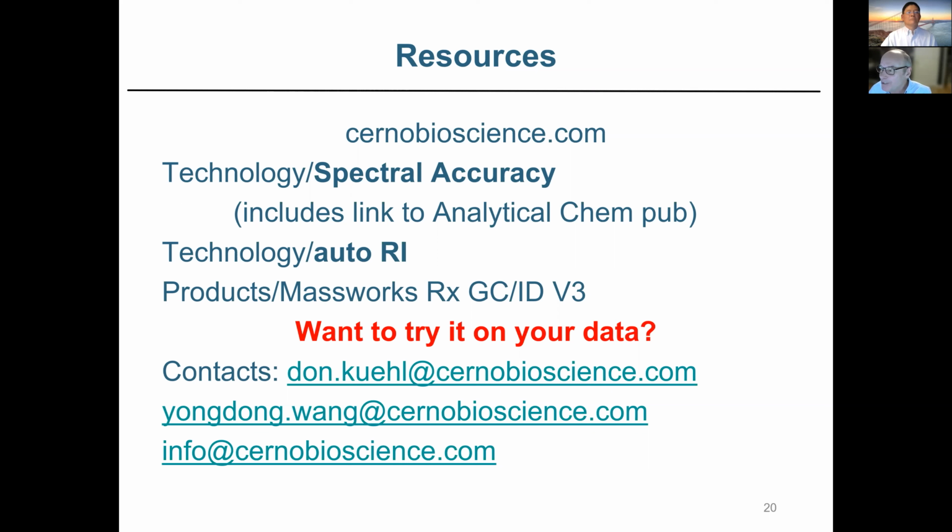What it also means is that you can take data that you ran 10 years ago in centroid mode and run it through the system and identify the compound that maybe you didn't get right 10 years ago. So it's a nice solution. It doesn't give you the accurate mass, but it gives you everything else, and a lot of times that'll solve the problem.